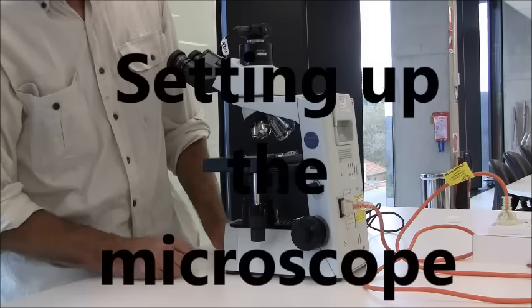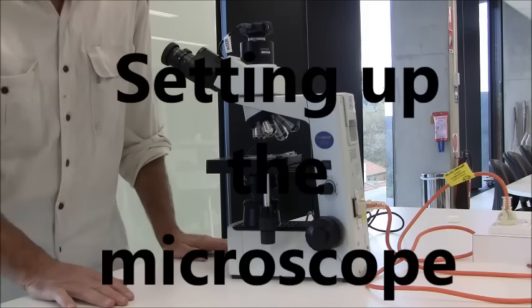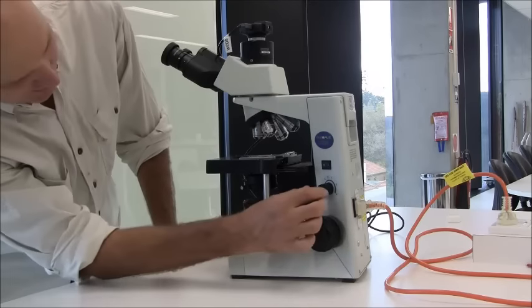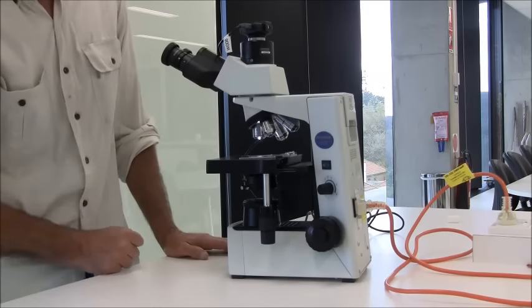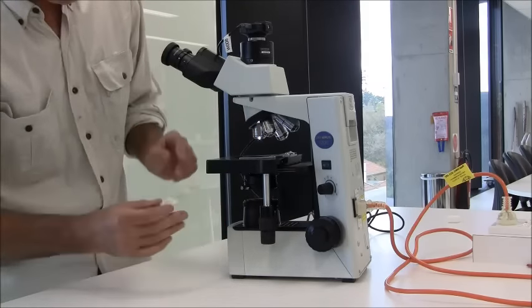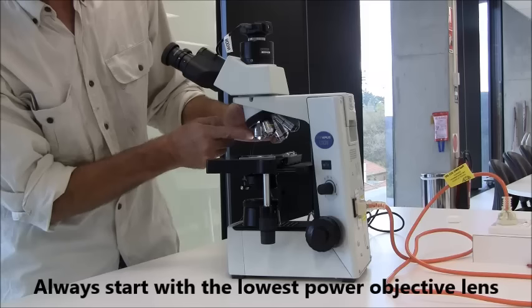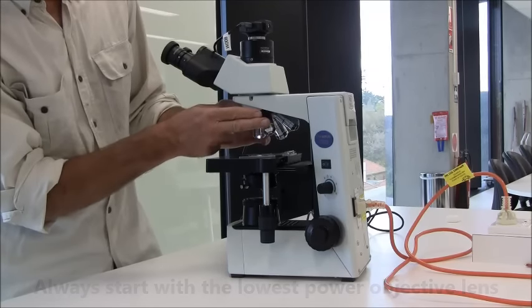Now, setting up the microscope is a little bit complex. The first thing that you would do when you set this microscope up in front of you is, of course, to plug it in and switch on the light. Make sure you are getting some light coming out of the light source. You would get your slide that you're going to view and clamp it onto the stage. This is very important. Make sure that you are using the low magnification objective lens that's clicked into place.